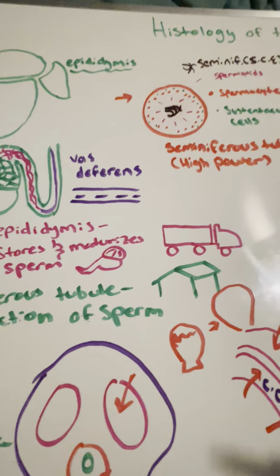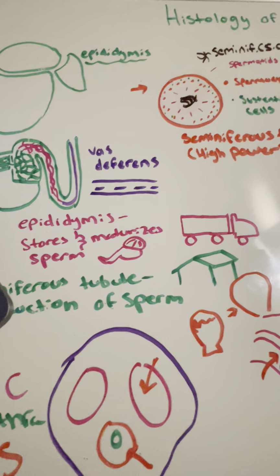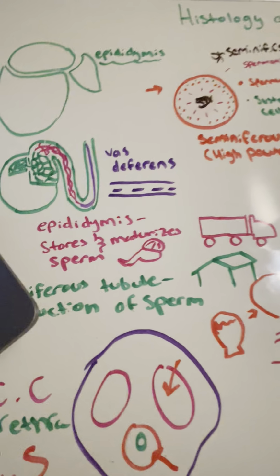It'll be basically the same thing for the histology. Little shapes are the thing that really helped me understand the difference between different structures in histology. So I honestly really hope it helped you guys.